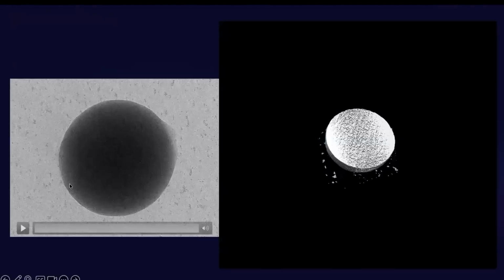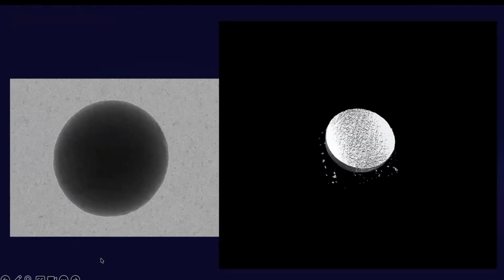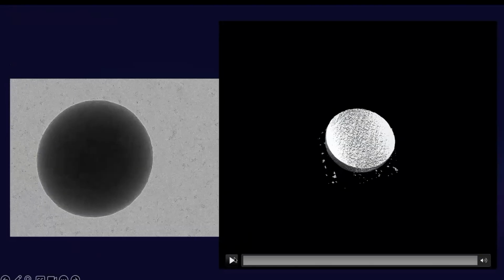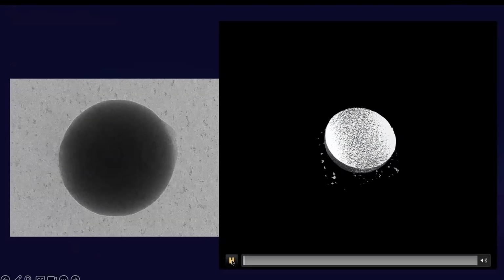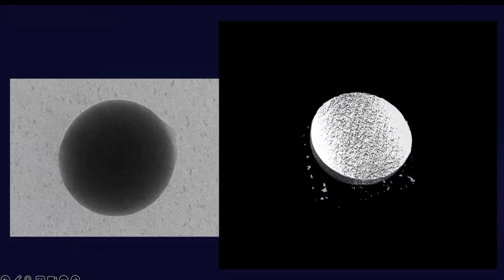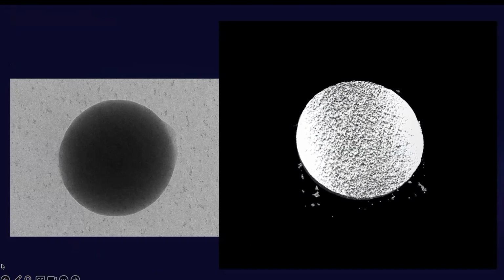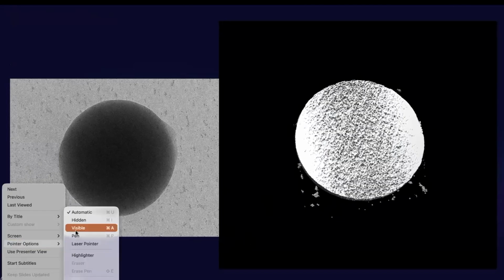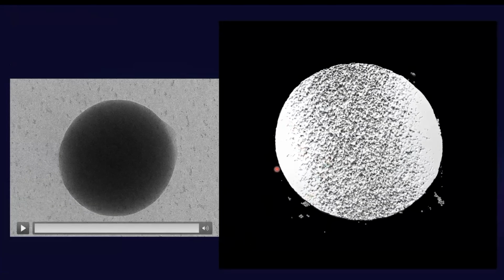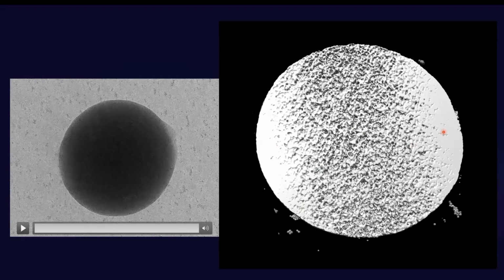However, sometimes tomography can beat the formula. Here is a massive structure, more than 500 nanometer, and we can still get a very nice, beautiful structure and internal details. But there are other limitations, because if you tilt on only one side, you also have a missing wedge.